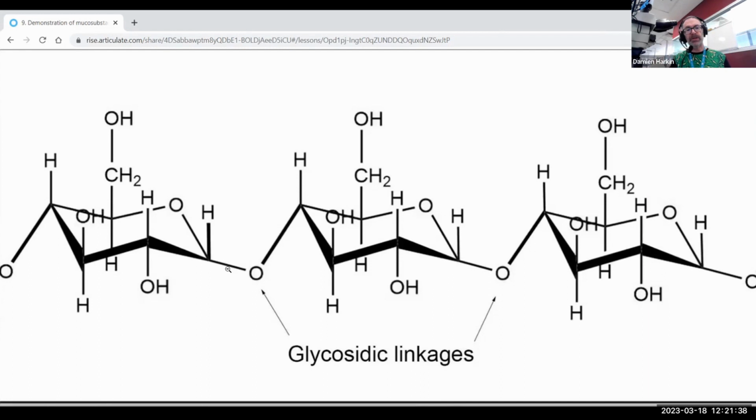Once again, you can see that as a consequence of being polymerized, these glucose monomers have avoided generating any negative charges. And so this, what we call polysaccharide of glucose or glycogen, will still retain similar staining properties to what glucose has. And so in fact, when we're talking about staining for glucose in tissues, we're not usually staining glucose, we are actually staining glycogen. And so we'll see some examples of staining for glycogen in skeletal muscle in the second video. Okay, so absence of negative charges, but we've got these adjacent hydroxyl groups, and so they'll have the potential to be oxidized to a dialdehyde, and then will subsequently react with Schiff's reagent.